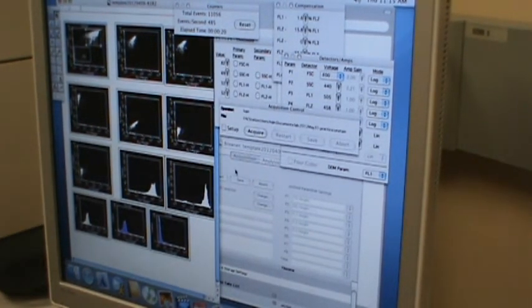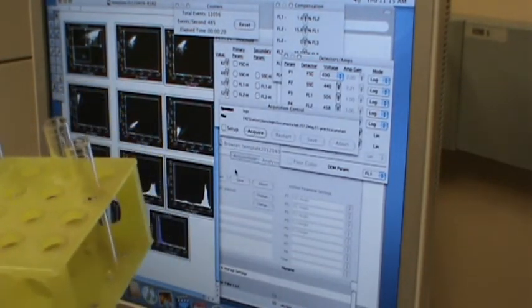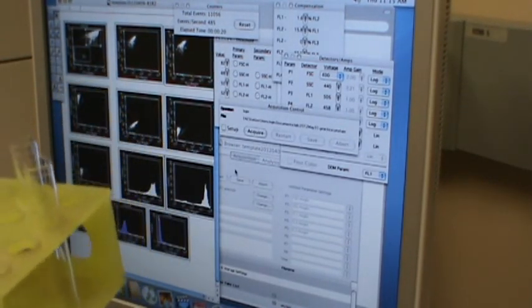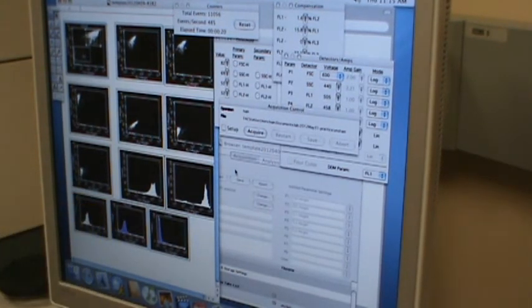Now you need to keep track of which tube you are working on. So this is the tube, and this will be the next sample. You want to take the next sample with this live cell. Vortex it, so they won't stick together. And then pull this tube out. To keep track of things, we put this on top.